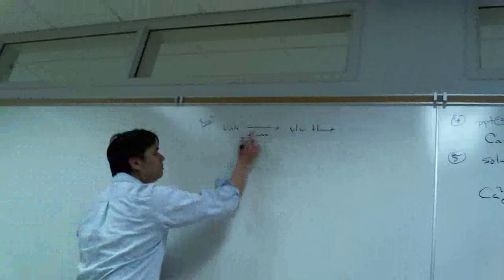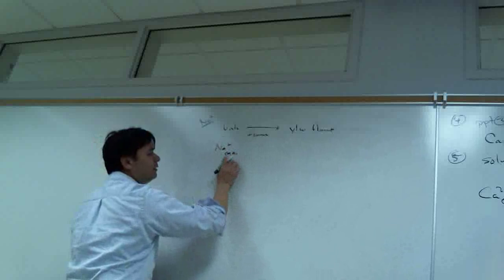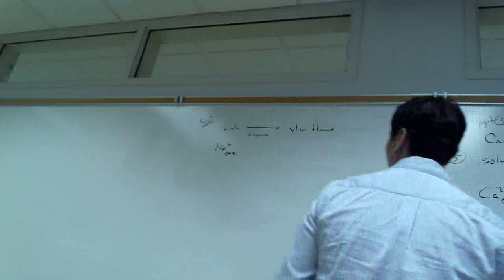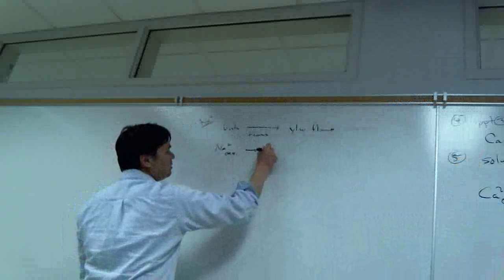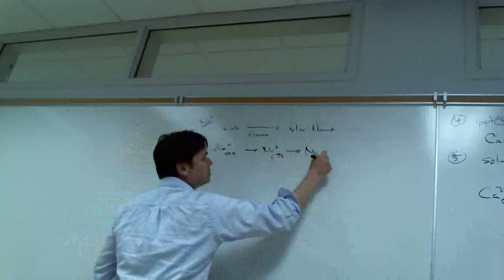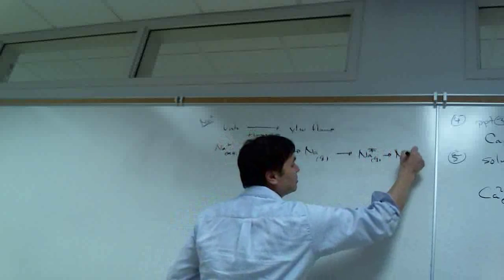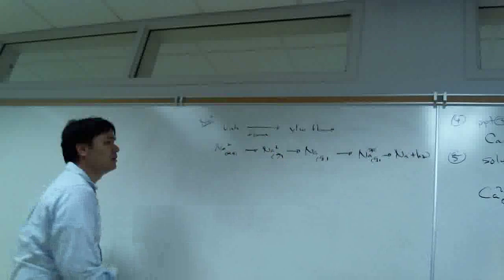And so with the yellow flame here, we know we have sodium ions present in solution, and you only need minute quantities. Calcium is very insensitive, that is, you need large quantities to really see that. But here, no problem seeing this. We vaporize the sodium ions into the gaseous state, and then reduce those to sodium metal atoms in the gaseous state, then excite those, and then let those drop back down to the ground state and emit a photon. So that's the sodium ion test.